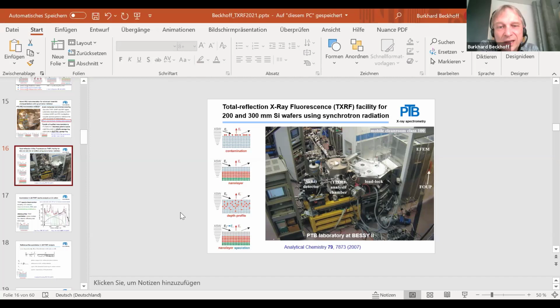The only thing, we still have one or two of the Si(Li) detectors, and this is for the range 20 to 35 kV, for example, for geological applications. It's still interesting to have one or two of them. And our engineers, I hope they are not following, are unhappy that I'm still preserving one or two of them.